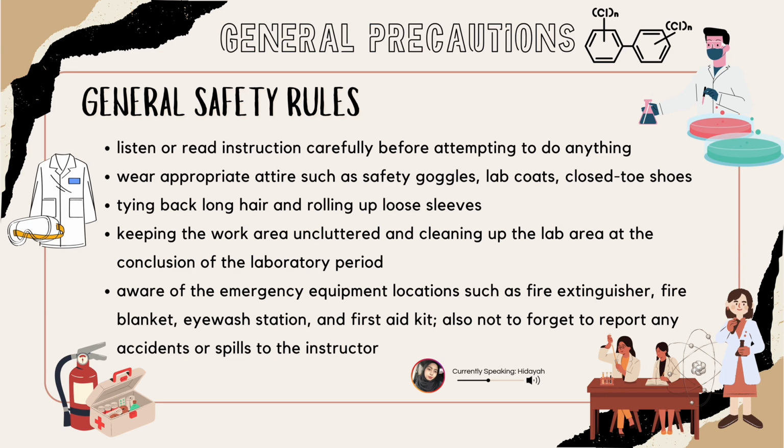Keep your work area uncluttered and ensure you clean up the lab area at the end of the laboratory period. Be aware of the locations of emergency equipment such as fire extinguishers, fire blankets, eyewash stations, and first aid kits. And remember, report any accidents or spills to the instructor immediately.